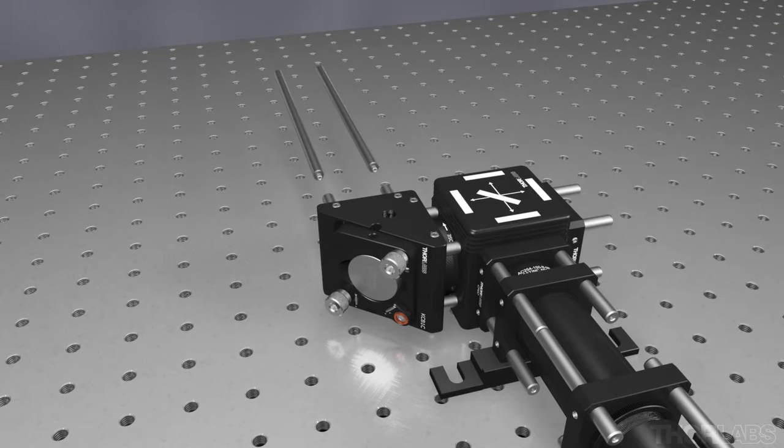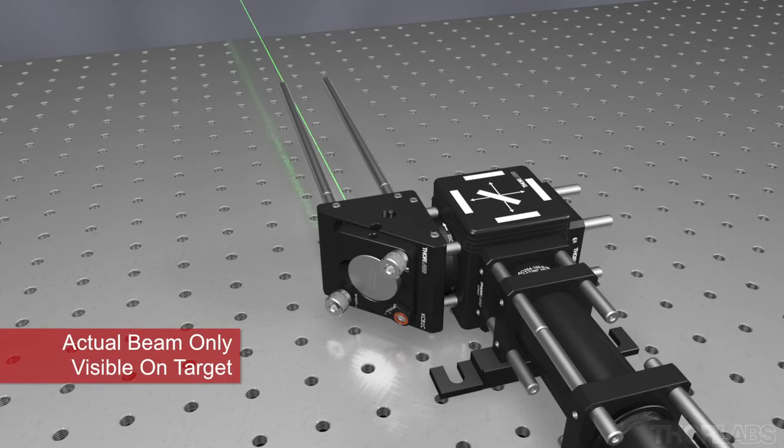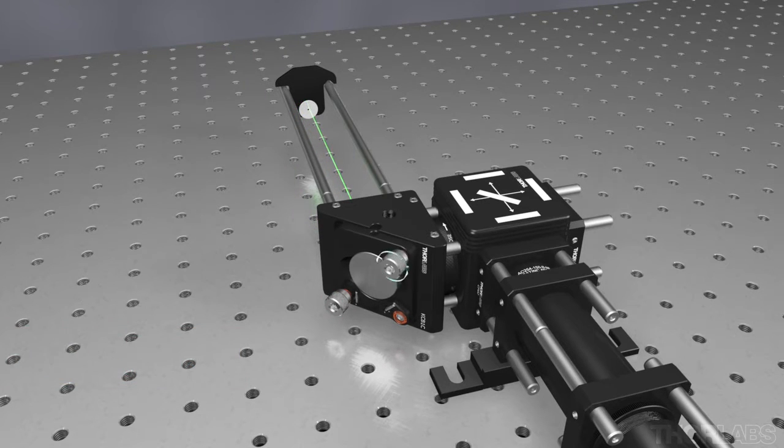Finally, check the centration through the exit of the beam expander module. Again, place the target on the ER rods and, using the knobs on the final mirror, center the beam on the target.